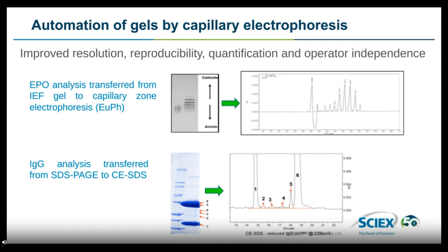And this has also been applied to the analysis of monoclonal antibodies like IgGs, and this is shown in the bottom example. And here again, you'll see a gel electrophoresis plate where the colored bands mark the migration of proteins through the gel. The darker the color, the more concentrated, the more protein present in that band. And you can see next to it on the right-hand side the capillary electrophoresis trace in the CE-SDS analysis of the same sample. And you can see, obviously, the areas are easier to calculate from the automatic integration you get with CE. And again, this method is highly reproducible. So basically, CE-SDS has been used in the biopharma industry for well over 10 years, and there are ring trials to show how reproducible this method is in monoclonal antibody analysis.